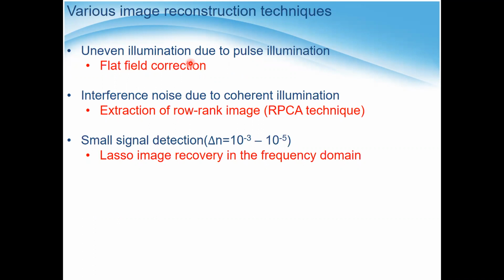The other one is that we observed a lot of interference noise, because the illumination light is a laser, and a laser usually gives coherent noise. We found that RPCA, the principal component analysis based algorithm, could remove this kind of noise.